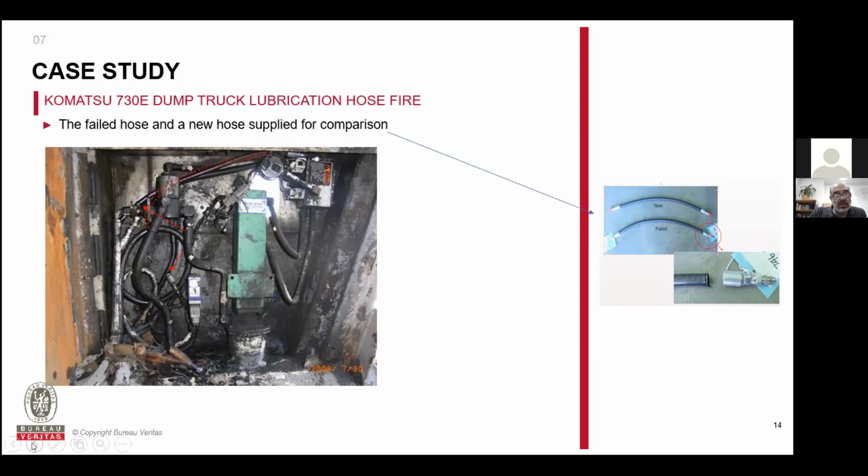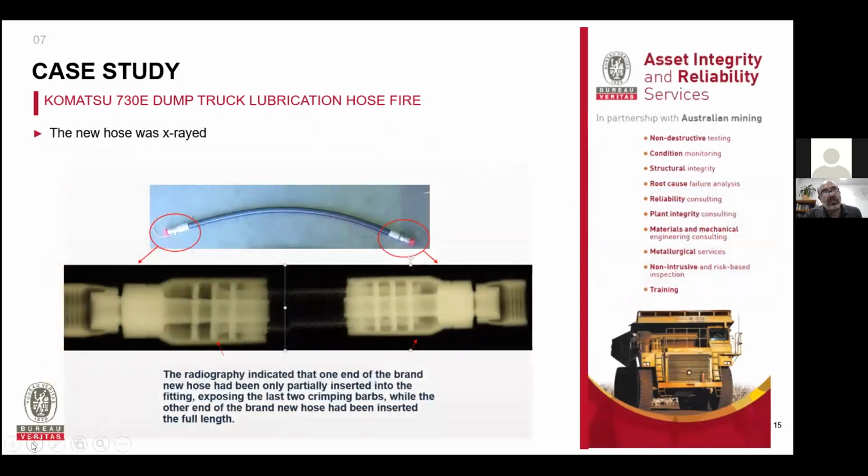What we did with the new hose was x-ray it. That's another thing I probably haven't touched on at the beginning of the presentation: in addition to the metallurgy, there's also a lot of NDT, non-destructive techniques, that can be used to assist a fire investigation. This is one of them, where we used x-ray. We x-rayed both ends.